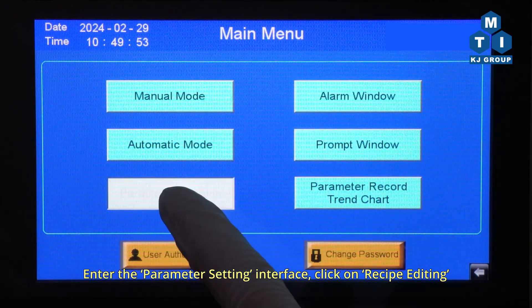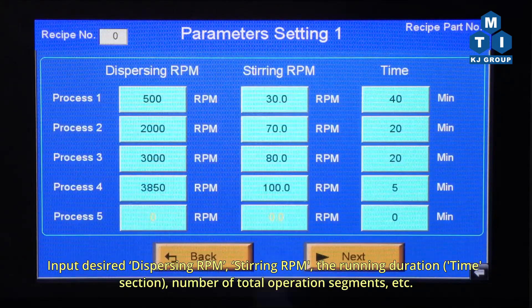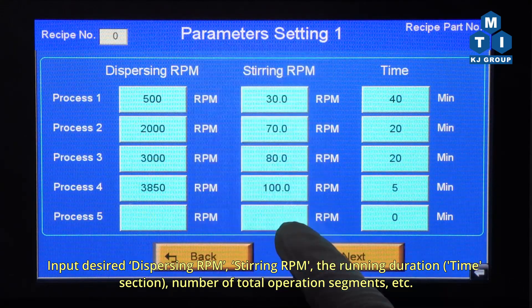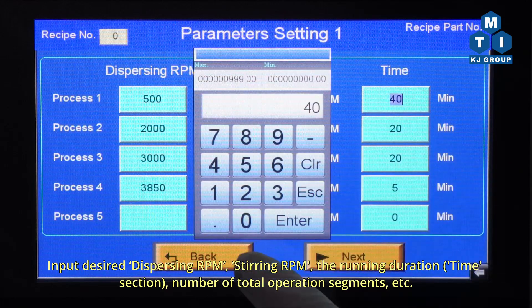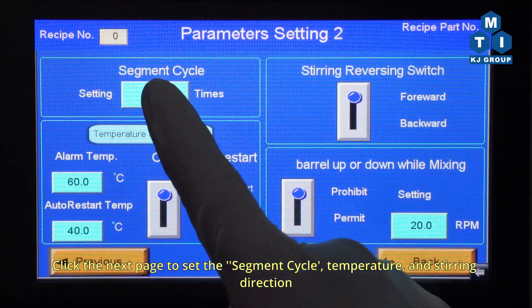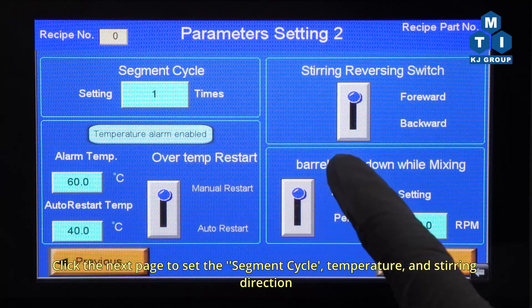Enter the parameter setting interface and click on Recipe Editing. Input the desired dispersing RPM, stirring RPM, running duration, time section, number of total operation segments, etc. Click the next page to set the segment cycle, temperature, and stirring direction.